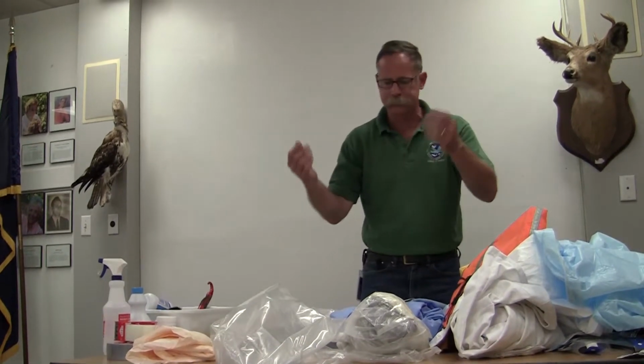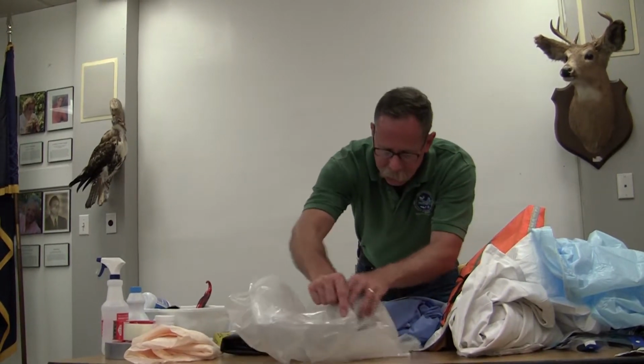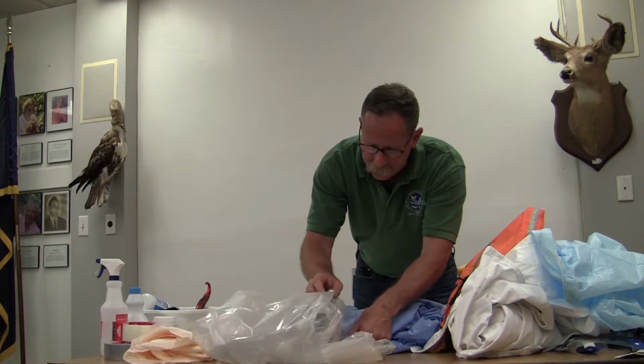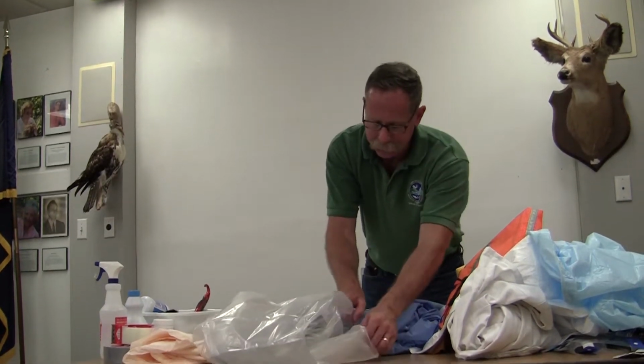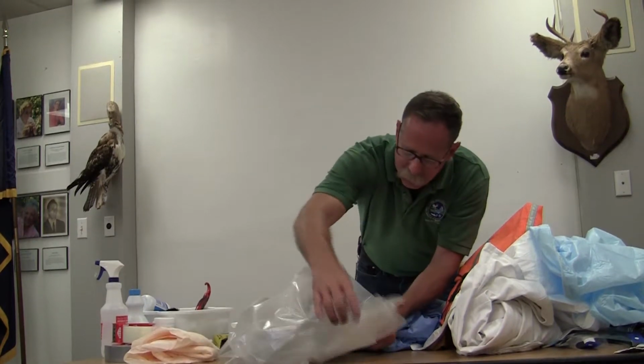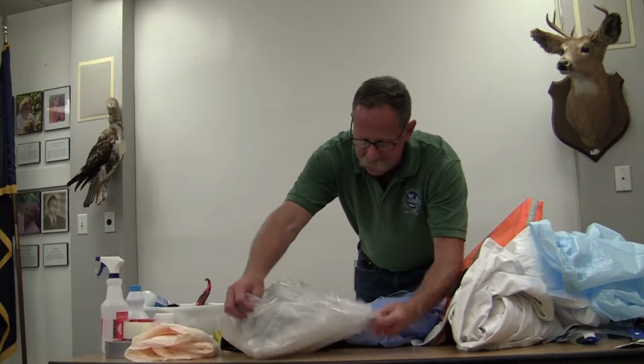You're going to have gloves on, and you're going to slowly grab the carcass and try to push it in over the lip, trying to get it inside a little bit. I'm making it look real easy here because it's hard to do, but you can do it. Once you get it in past there, you can start to bring the outside of the bag over. The weight of the deer will hold this, and you can bring this around.